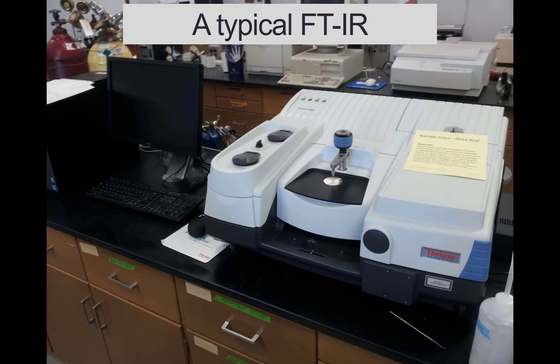This is a typical FTIR or Fourier transform infrared spectrometer. We've got a computer off to the side. We have our instrument itself. And basically what this is set up to do is to generate light in the infrared spectrum, pass that through or with this attachment, bounce it off of a sample, and then detect which parts of the light are either reflected or emitted, or sort of passed through the sample. And based on that pattern of what's been absorbed and what has passed through, we can determine what functional groups are present in the molecule.